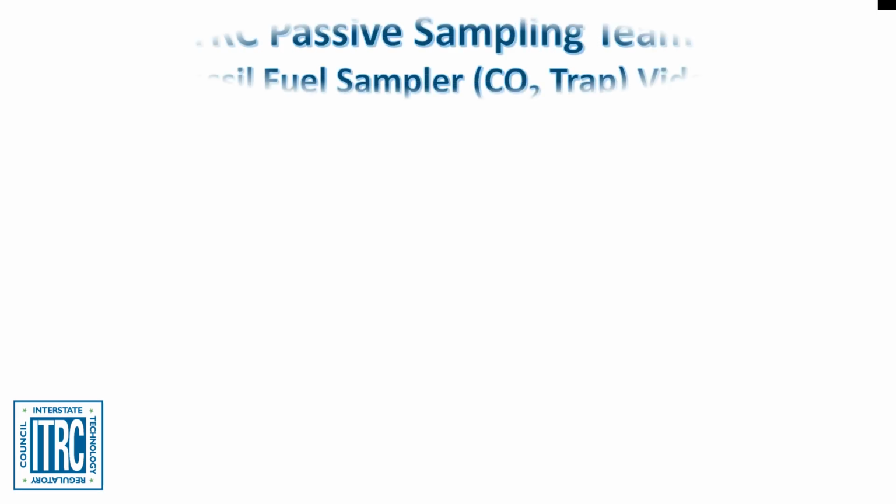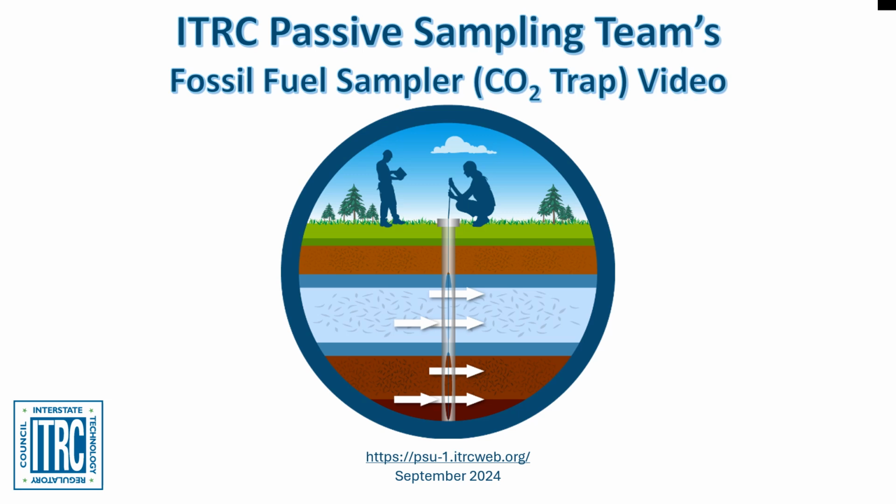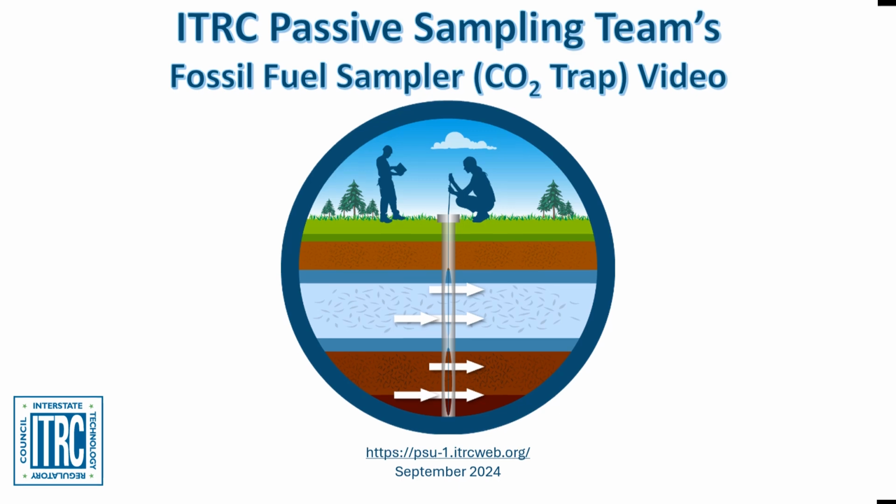Welcome. The Passive Sampling Technology Update team is proud to present an overview of the fossil fuel sampler, also known as CO2 trap technology. This quick video will provide a high-level overview of the device, as well as instructions on how to use, deploy, and retrieve the device. For more information on this and other passive sampling technologies, please visit the Passive Sampling Technology Update Guidance document.